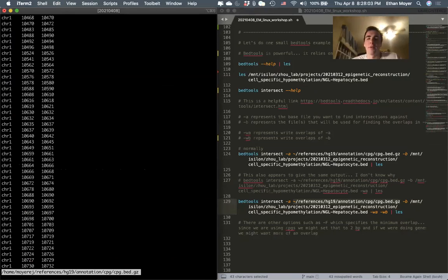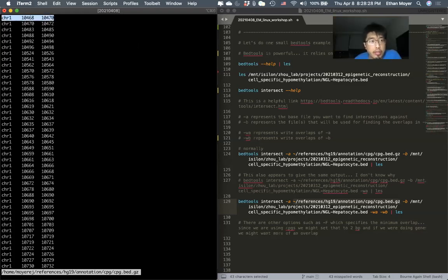I have a quick question about the CpG location. And I think Wending answered me once, but I forgot about it. The CpG is a C and G. So why are there 3 locations listed? I mean, 3 spaces for 2. What do you mean? So one cytosine and one guanine. So why need 3 spaces to store 2 dinucleotides?